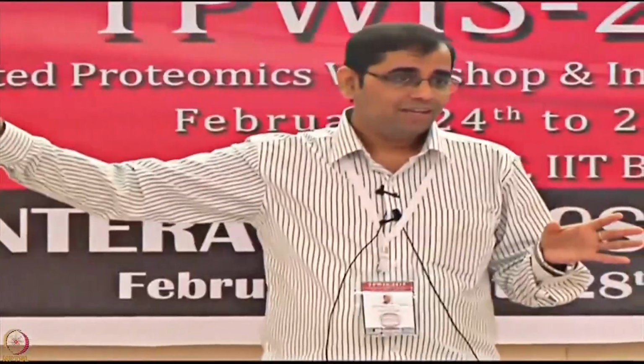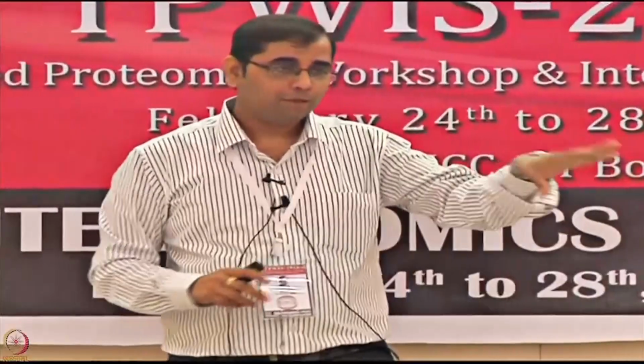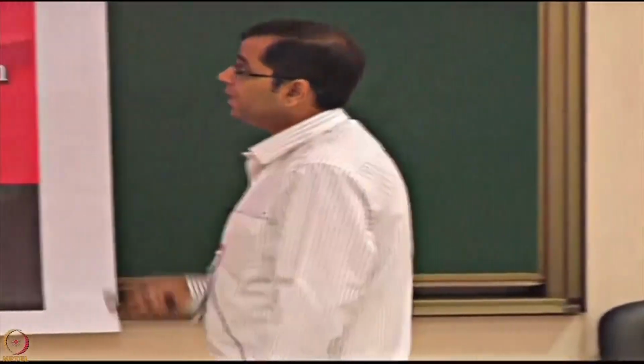Sometimes a good experiment may involve every technology which we are studying in these different workshops right now, starting from discovery with mass spec based stuff and microarray based stuff. Take those leads forward and then validate using these kinds of label-free platforms. So everything has its own utility, and you have to pick the technologies in the right context.